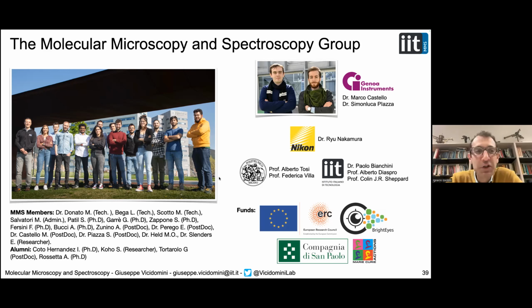I have another question. It's a bit of an interested question, and I see that you have a paper and a preprint. So my question is, how does it compare for localizing single molecules with respect to a camera-based approach?